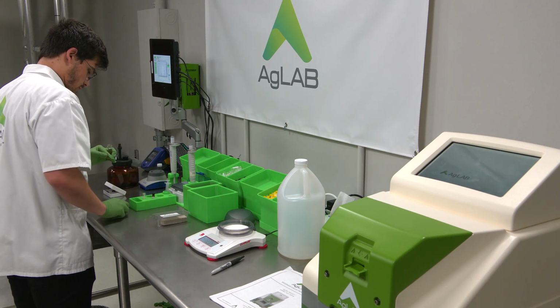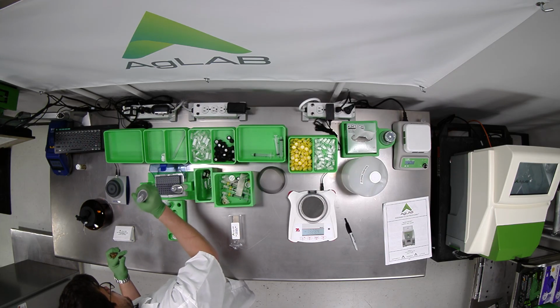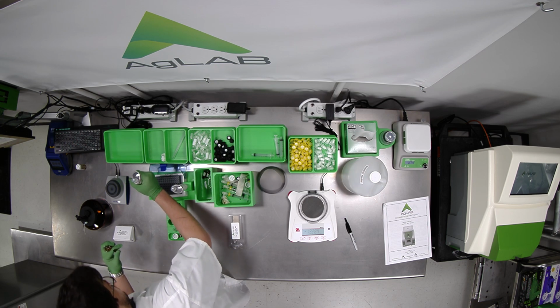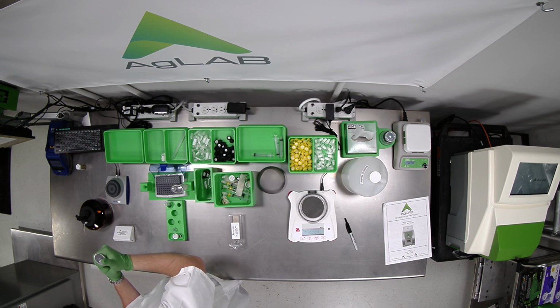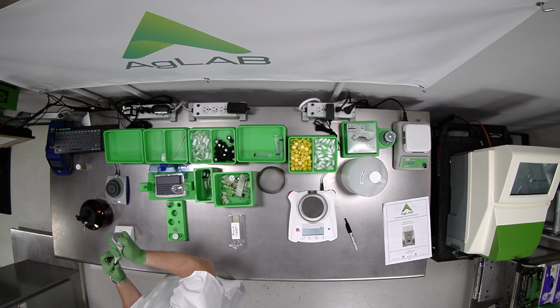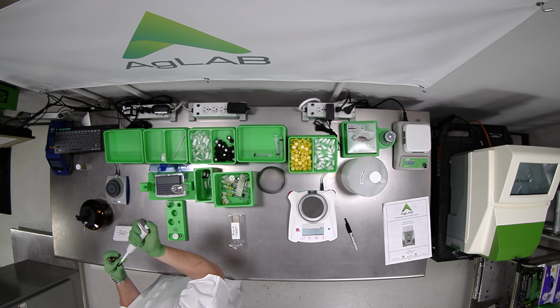Okay, we have our D1, we have our D2. Same thing that we did with the head samples. We're going to take our 10 microliter pipette, tip right into the solution, not too far in. Same thing on the other side, dip it right into the solution, rinse, rinse, rinse, down into the solution, pressing all the way and bringing it up against the glass. You can see a tiny, tiny bit still in there. I can kind of pump it out. Let's see. Yeah, it looks good.